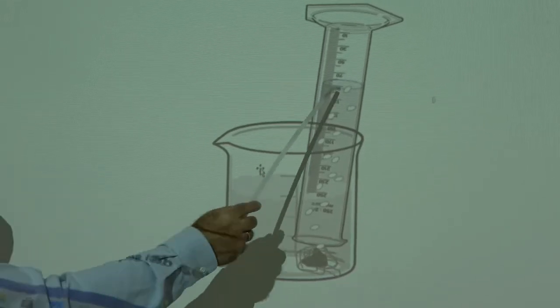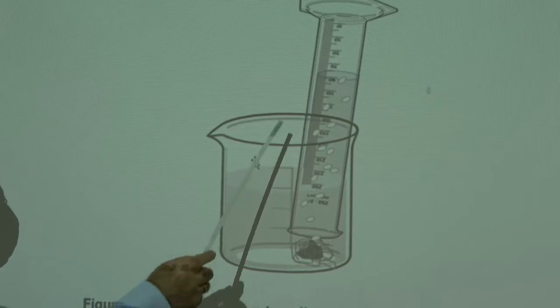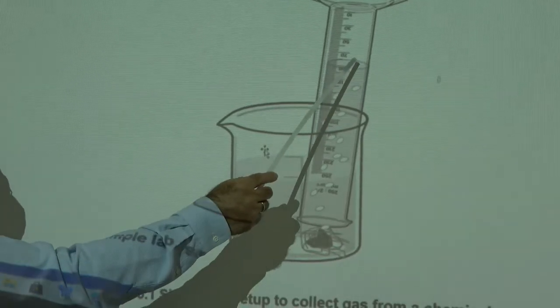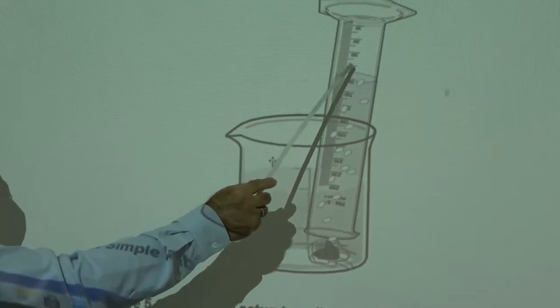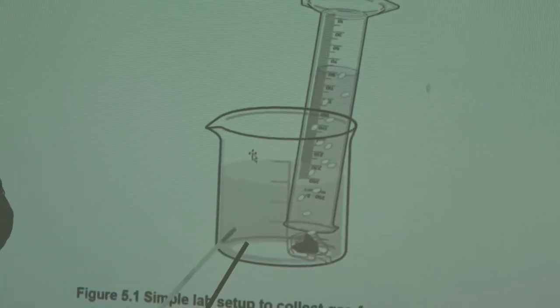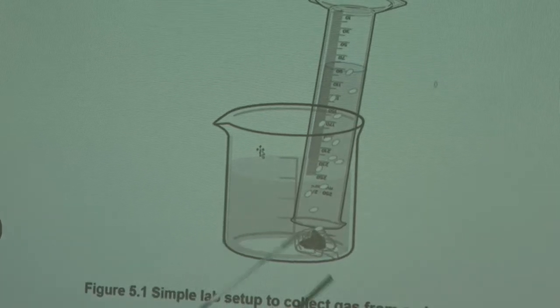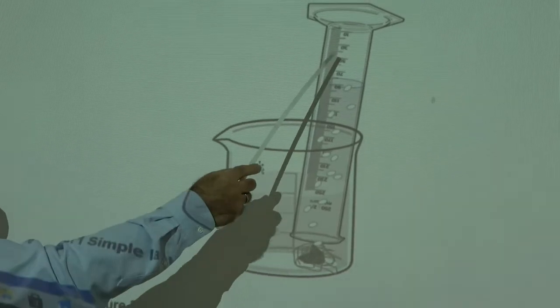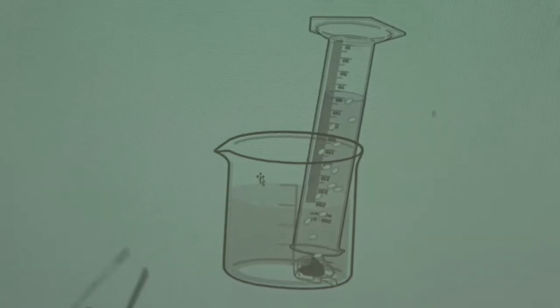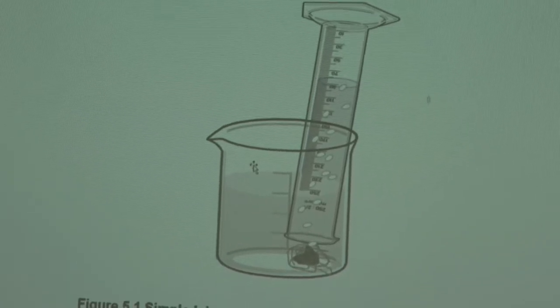To obtain the pressure of the water vapor, by knowing the temperature of the water, you're going to use a table that is at the end of your lab manual, in which you have listed the vapor pressure of water as a function of temperature. And you're going to subtract it from the total pressure, which is going to be given to you by your instructor.